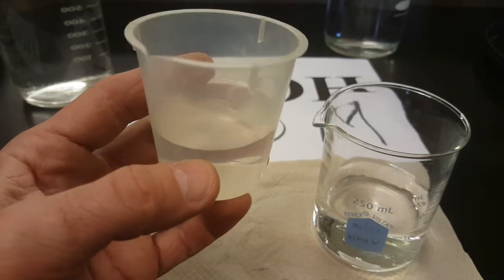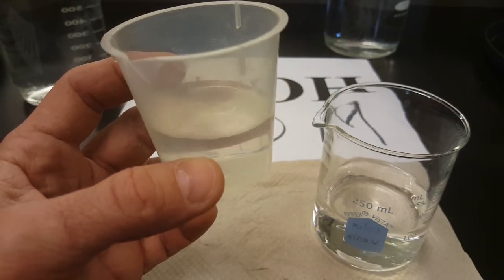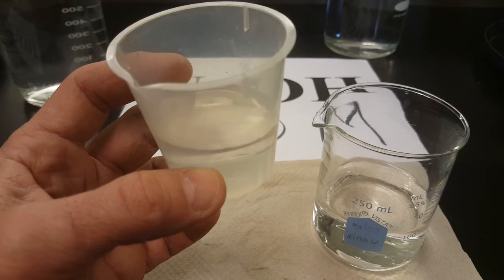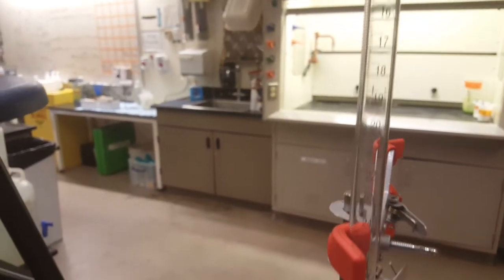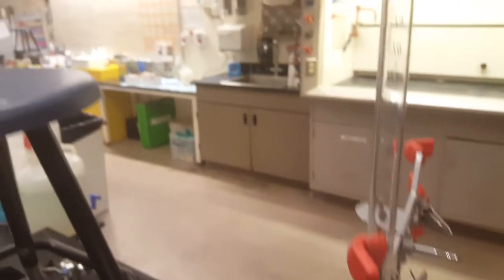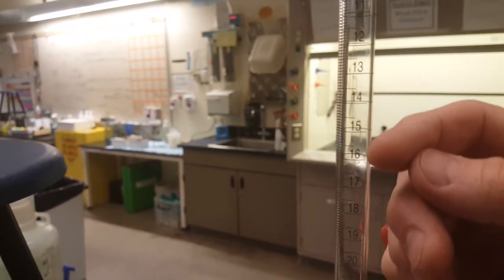I have my approximately 50 milliliters of sodium hydroxide, and I'm going to put that in my burette now. Let me show you how to do it. This thing is your burette, and there's a stopcock at the bottom of your burette, and I want you to pay really close attention to the fact that the numbers go backwards.